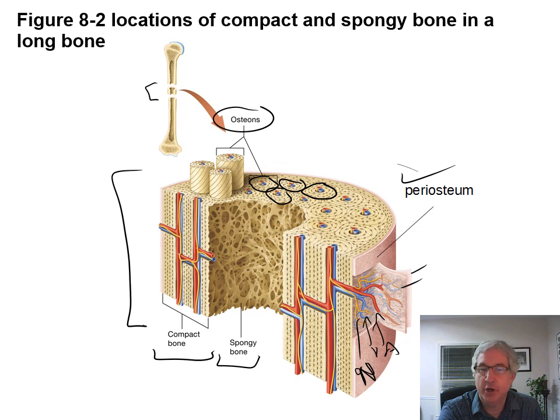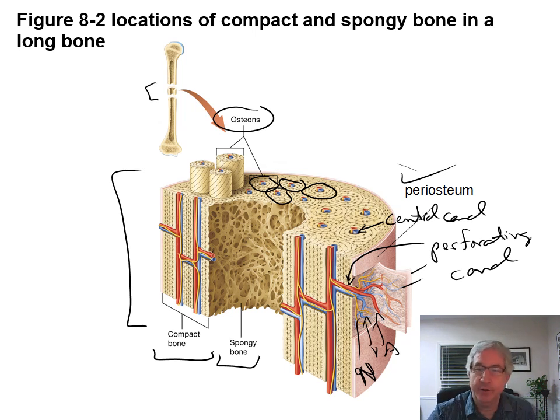Okay, so this is a central canal, and this is called a perforating canal, because they go sideways through the bone.